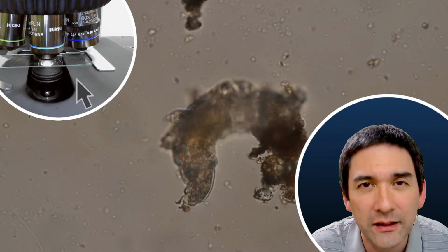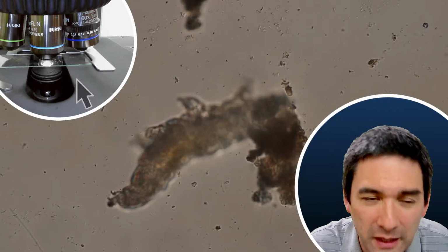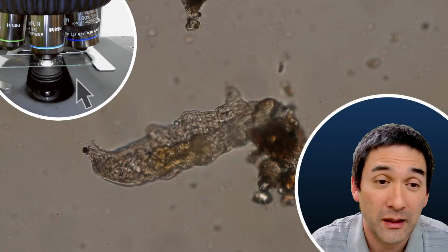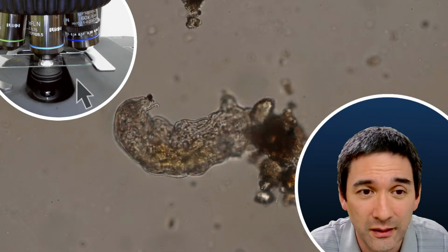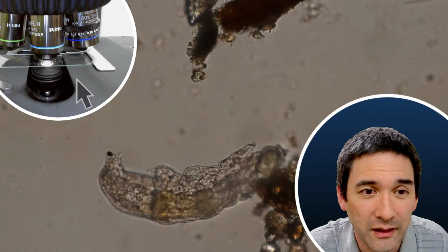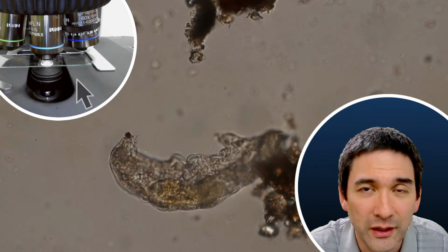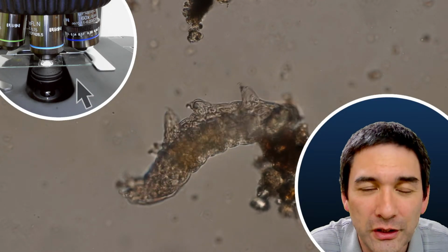I even had the instruction manuals, the service manual. Everything was documented on how to take the mechanical stage apart. I didn't have the right tools, I discovered, and the ball bearing system was so complicated that I really had problems putting it back together again. So ever since then I said don't touch a running system.